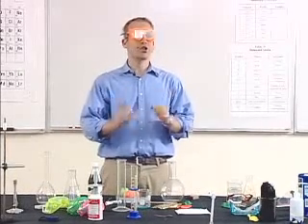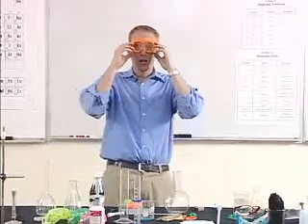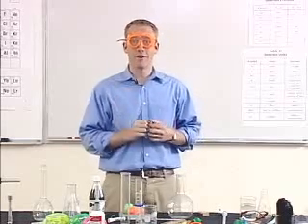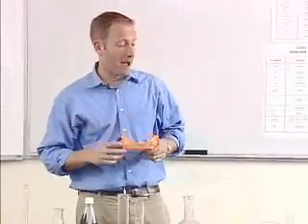And in this lesson, you're going to learn everything you need to know about lab skills and how they apply to the Regents. The first thing you're probably saying is, why are you wearing safety goggles? Well, you shouldn't be asking that. You should know why I'm wearing safety goggles. I'm wearing safety goggles because I'm in a lab. The Regents loves to ask questions about safety.